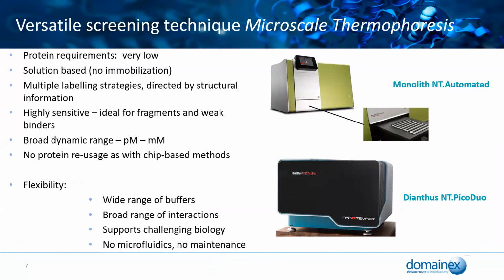Finally, in terms of the screening assay, it's critically important to have good quality screening assays. It's important that the screening assay you choose is in line with your target. The technology that we use at Domainex regularly is microscale thermophoresis. This is a technology that I've been appreciative of for years beforehand, before joining the organisation. And it's got a number of advantages that we feel sit above other biophysical methods.